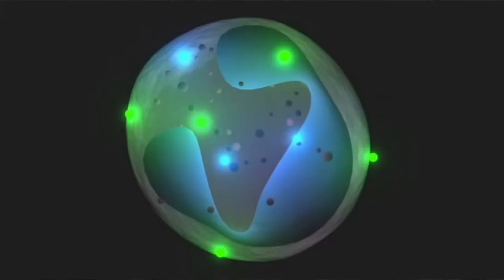And then another thing is detected, which is very important as well. This is fluorescence. This measures the presence of specific markers using fluorescent tags. So after the detection, what's the next step? These are the optics and electronics.